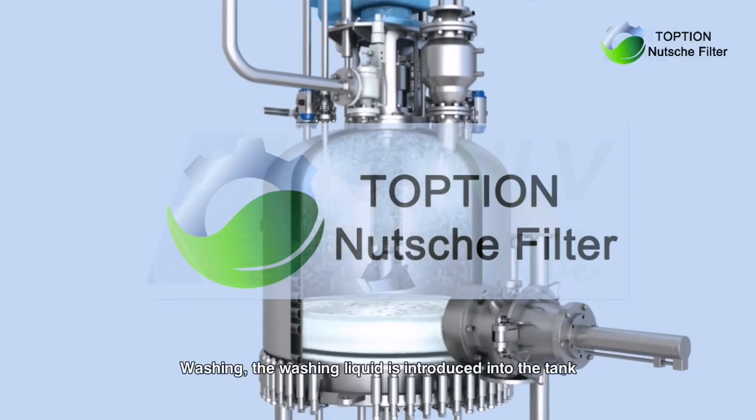Washing: the washing liquid is introduced into the tank. The cleaning fluid is washed by the rotating nozzle. The stirring blade still stays at a high position now.